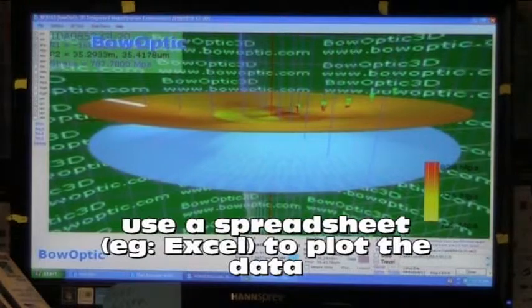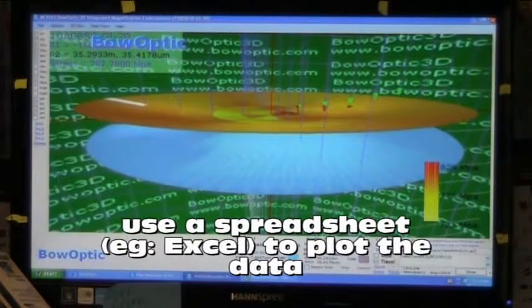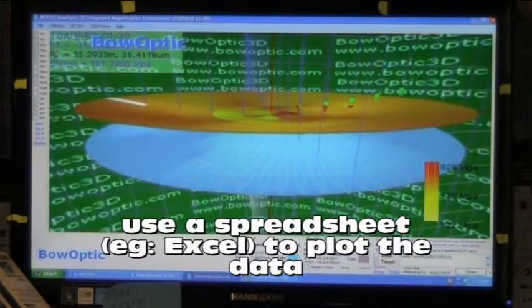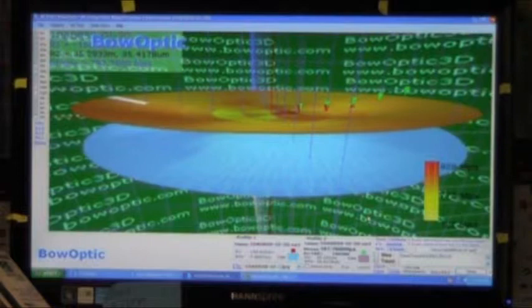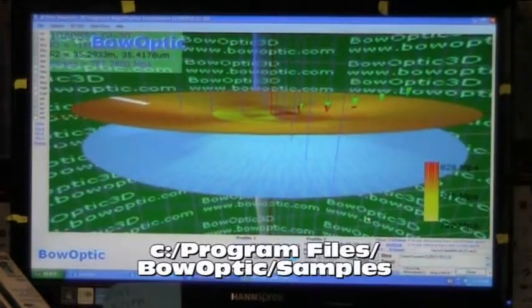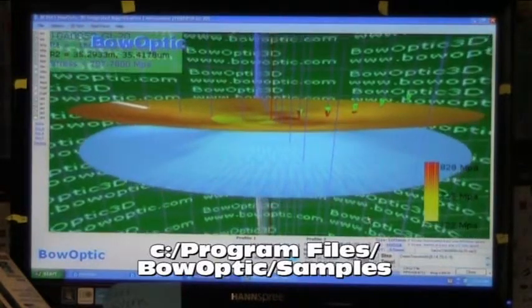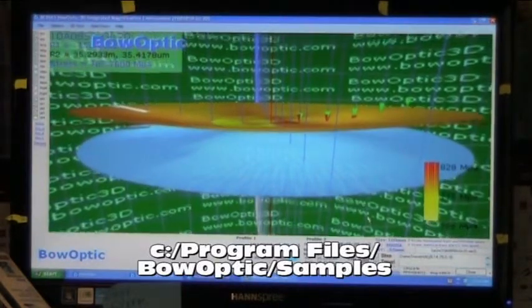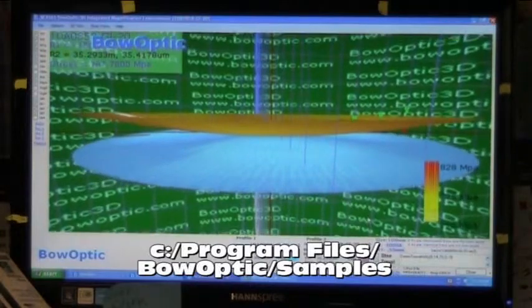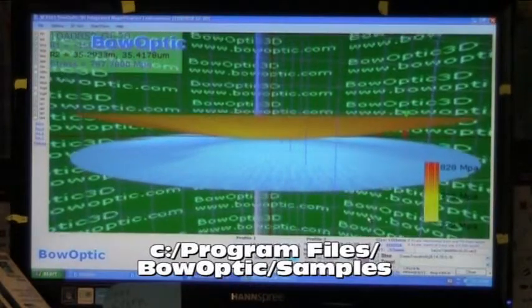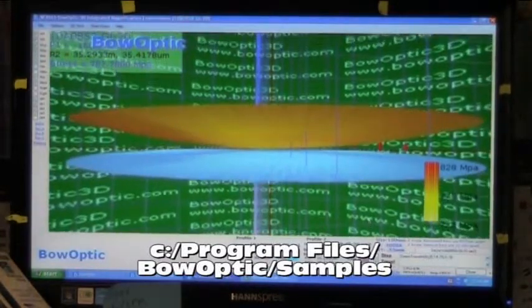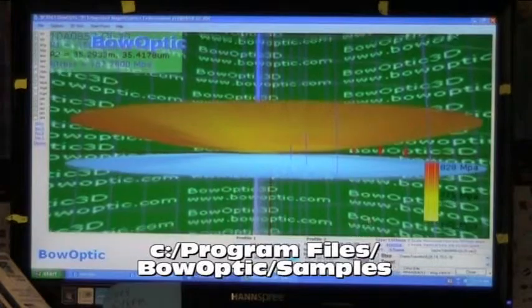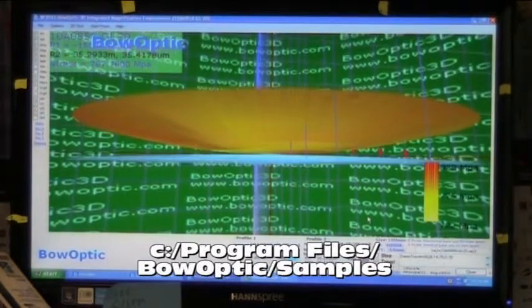I will demonstrate how to open the files in Excel and plot the 2D profile across the surface. The files are in a folder located on the C drive, Program Files, BOW Optic, Samples. That's where they are on the computer on the manufacturing floor and on this computer.